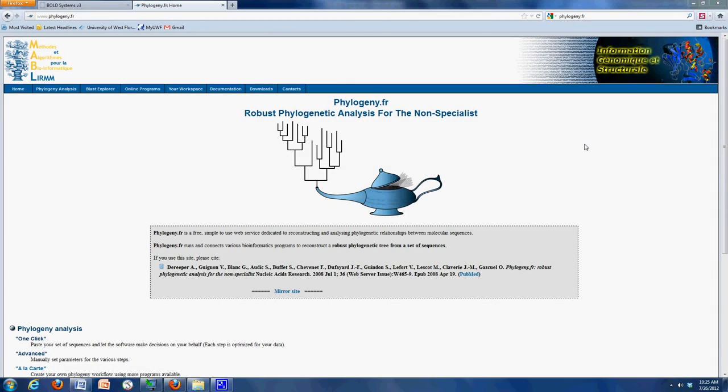Because of the difficulties that we ran into in class yesterday, I wanted to show you this so you could see it for yourself, see how the phylogenetic analysis works.